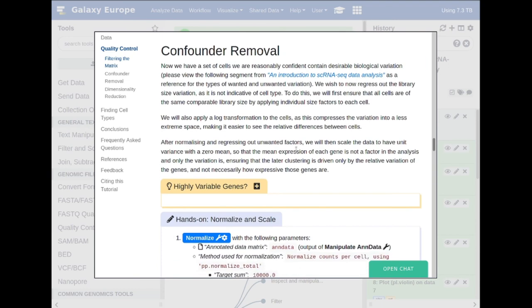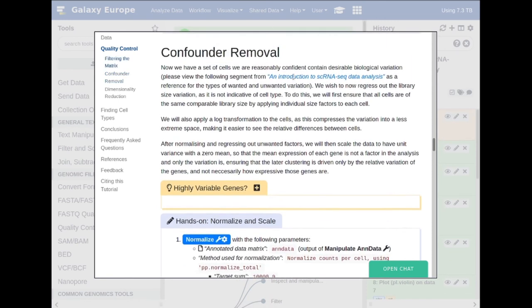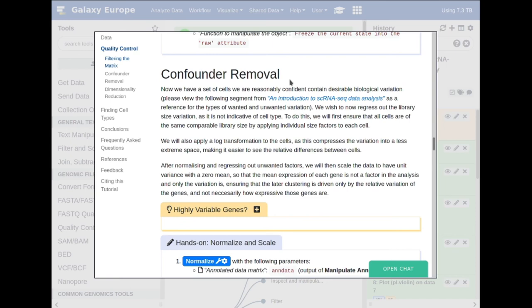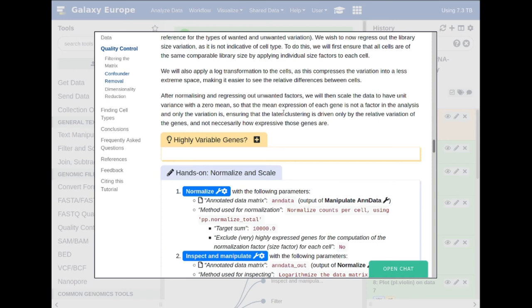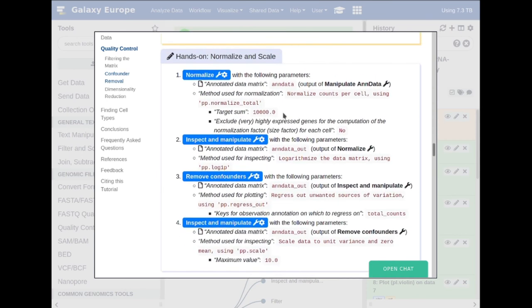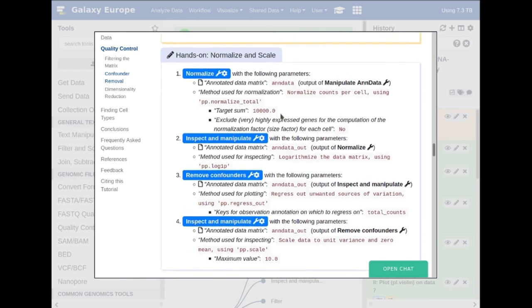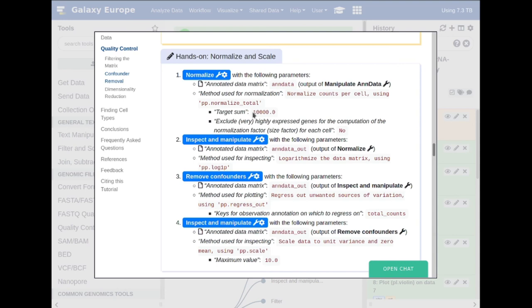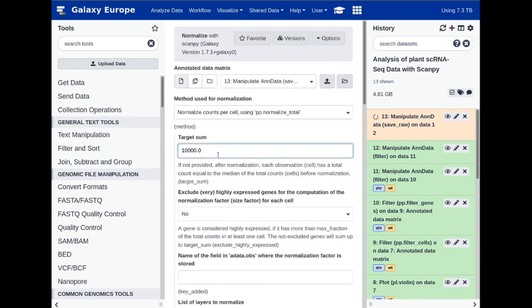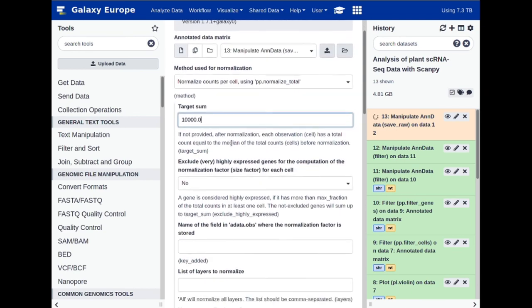What we wish to do next is known as confounder removal. Consulting the video at the time spot given, it explains the types of confounder removal you wish to address: unwanted biological variation, unwanted amplification effects, uneven cell capture rates — several factors we wish to remove from the analysis through fair normalization. We do that by clicking on 'Normalize' and setting a target sum to 10,000. This will normalize all cells to a target sum of 10,000 transcripts per cell. Click execute.